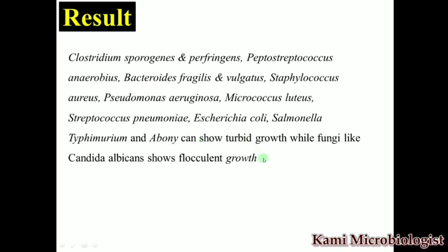And then we have fungi also. Fungi can also grow, like Candida albicans. It can also grow, and it can show fluffy growth. So this is the growth of the bacteria, and this is the result, and these are the bacteria that are showing perfect growth in this media.